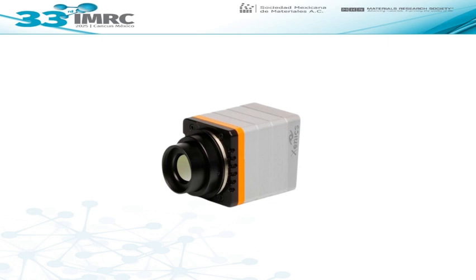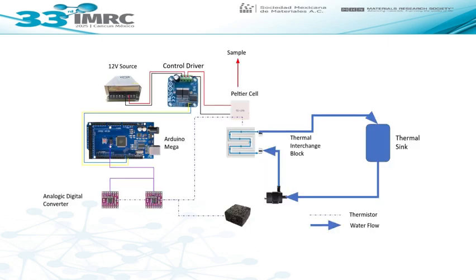Now, for the temperature control, this is a diagram of how it works. Our core in this control is an Arduino Mega board.